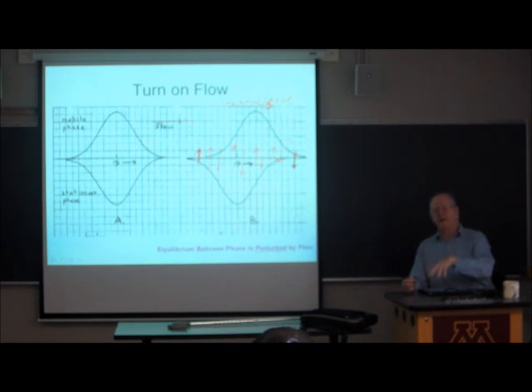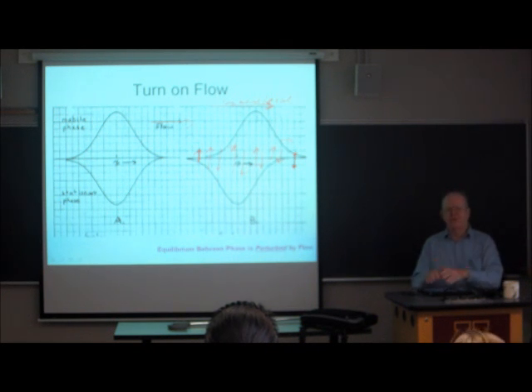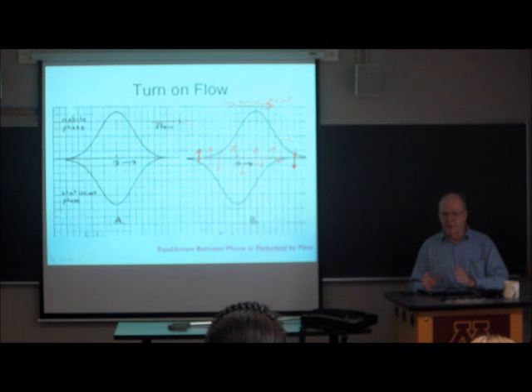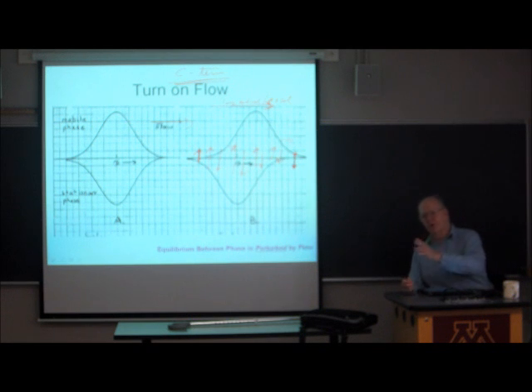Now, if I make the flow rate higher, or if I make the linear velocity in the axial direction higher, is this going to cause the HETP to go up or to go down? Going to cause the peak to get wider or narrower? Going to get wider. This is the C term, because it gets worse, it gets bigger as you increase the velocity.